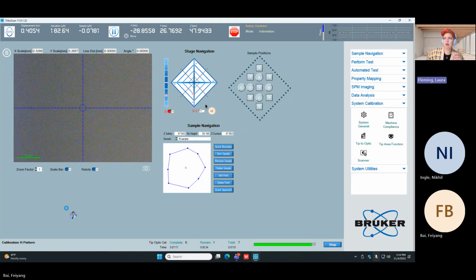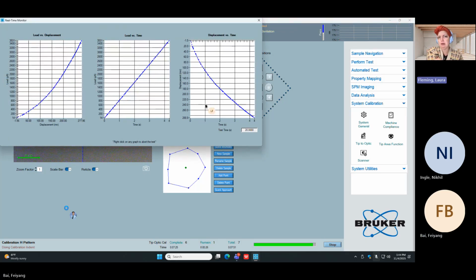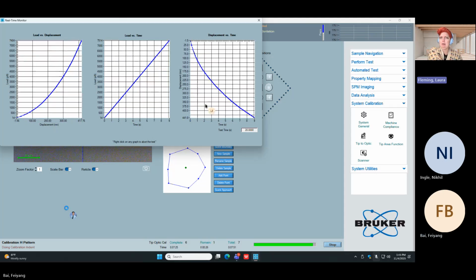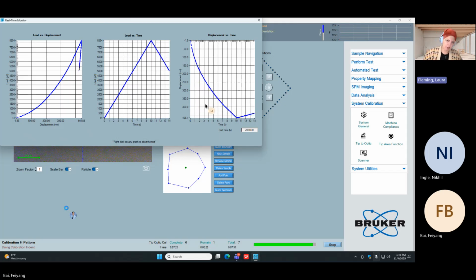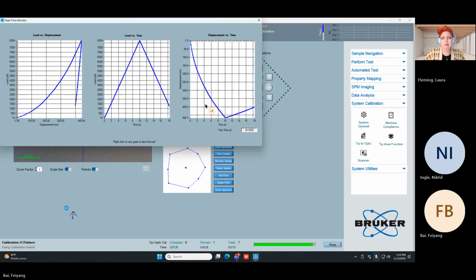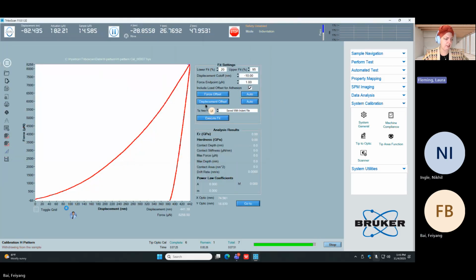The third upgrade is what we call a 1 Newton transducer. It looks like a soda can, and you put it on there. That transducer has different capabilities. It can still only indent, like the 1D transducer that we talked about, but it has a peak force of 1 Newton and a peak displacement of 80 microns. So it's often of use to people testing either very hard materials or very soft, squishy materials, and they need the extra displacement, because the standard transducer has a 10 millinewton guaranteed peak force and a 5 micron displacement limit.